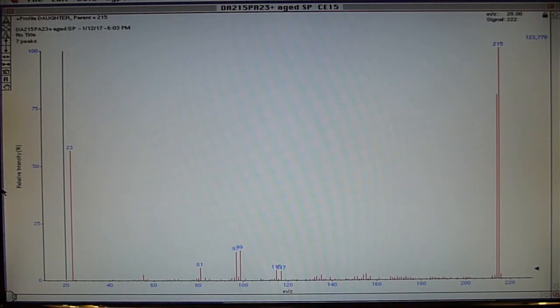This is the product ion scan of a two-week aged sulfapyridine and methanol water solution in which Q1 let in 215 and we had a collision energy of 15 eV. You can see right here we have a 23, so presumably the 215 is a sodium adduct of some sort and this line here is just a marker due to the software.